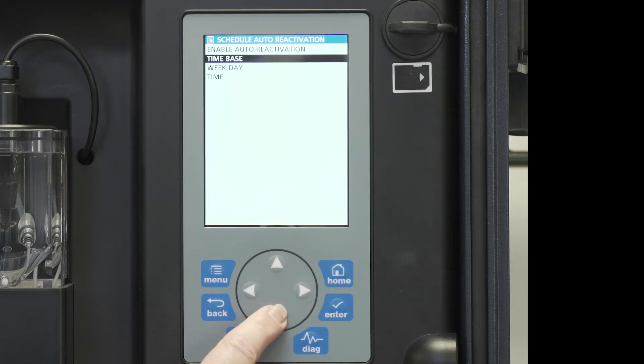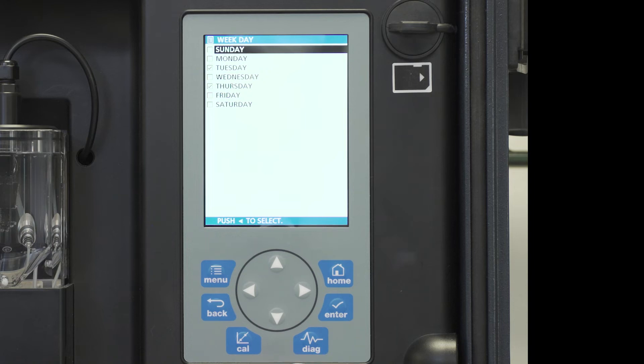We want to do this on weekdays. We want to do this for Monday and for Thursday. So I scroll down to Monday, hit the right arrow key.